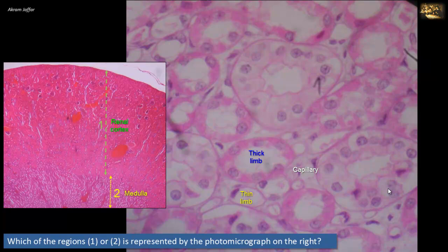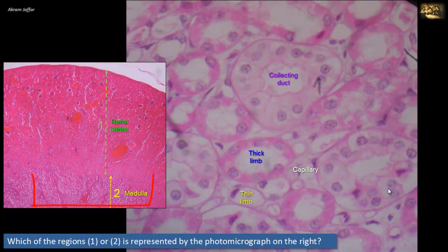There is also an abundance of collecting ducts, lined by cuboidal to tall cuboidal epithelium whose cytoplasm is lightly stained. Lightly stained cytoplasm, in comparison to the loop of Henle, is a differential feature of the collecting ducts. The presence of thick and thin limbs of the loop of Henle, in addition to collecting ducts, with the absence of glomeruli and proximal convoluted tubule profiles, confirms that this slide represents region number two — the renal medulla.